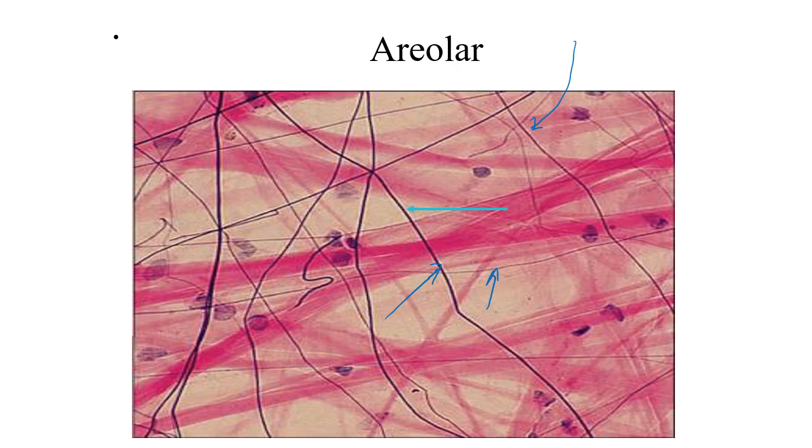They oftentimes don't really have very many visible branches that can be seen with them, and so we don't really see those there either. They're usually fairly thin versus collagen fibers, which are thicker, more robust. They don't stain quite as dark within the tissue itself. And then we can also sometimes see reticular fibers here as well. So areolar connective tissue is unique because we're going to see more than one fiber type.